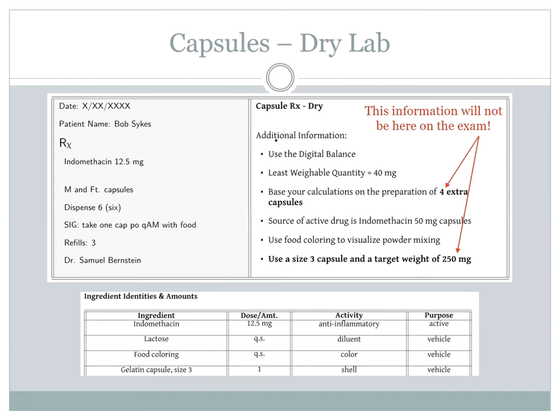But here's the deal. If this came as indomethacin 25 milligram tablets that you can break in half, then I still wouldn't compound these capsules. I would tell them to take a 25 milligram tablet and cut it in half. But as a capsule, that's not practical.